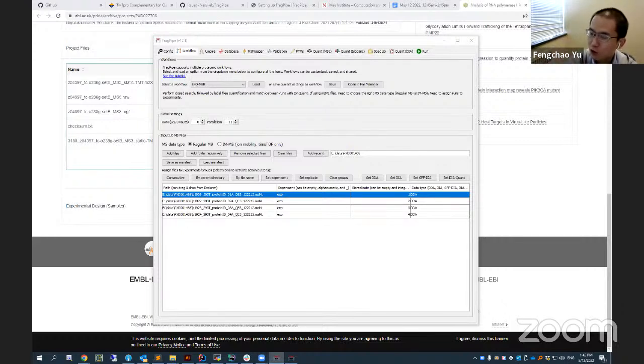For MaxLFQ, it uses more advanced algorithms, with some optimizations involved, to calculate the MaxLFQ intensity. You may need to check the literature to know the details of the algorithms.